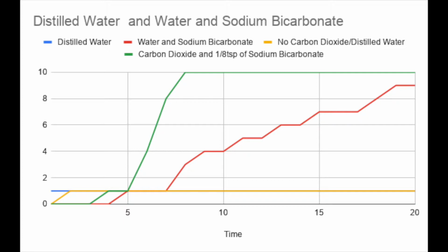I believe we did not have 10 discs float like this group did because we did not have extra or enough carbon dioxide to do so. The leaf discs absorb carbon dioxide from the atmosphere and give off water vapor and O2 all through the same openings, the stomata in leaves. The issue is that if there is not enough carbon dioxide in the environment, the stomata would be open for too long and would lose too much water vapor and dry out.